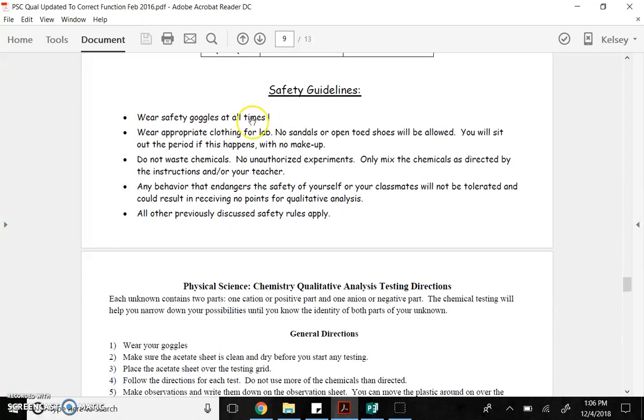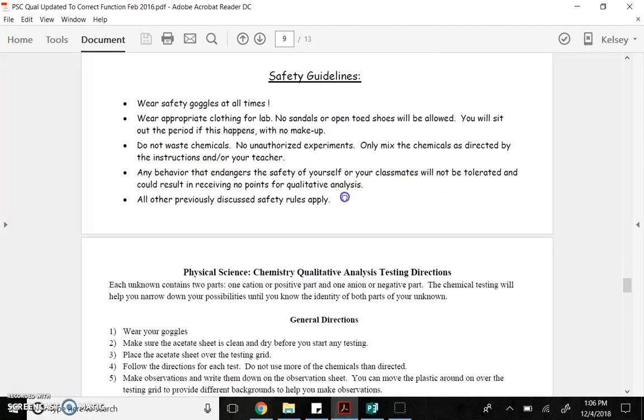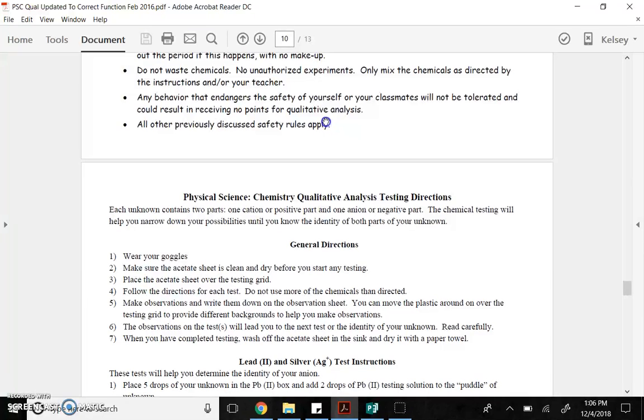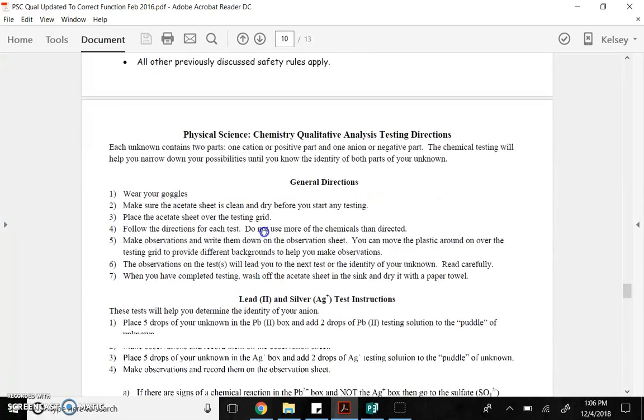Safety. Please wear goggles at all times. Make sure you're wearing appropriate clothing for lab. No open-toed shoes. Do not waste chemicals. No unauthorized experiments. Please make sure there's no horseplay, goofing around, no roaming. Stay at your lab station. Be responsible.